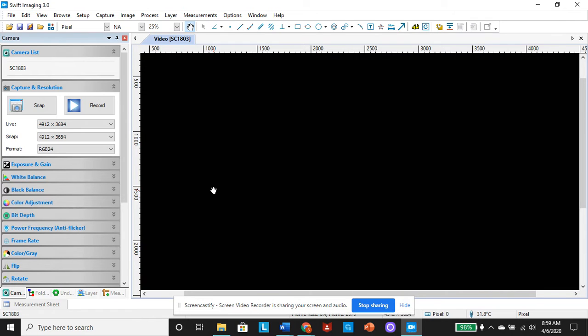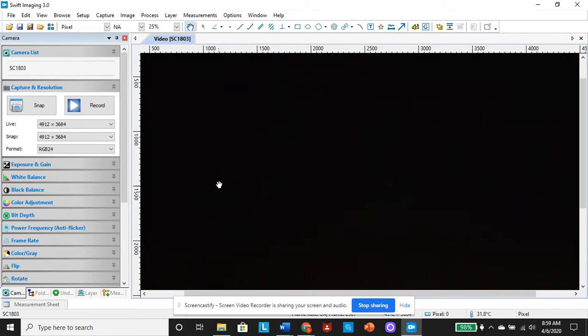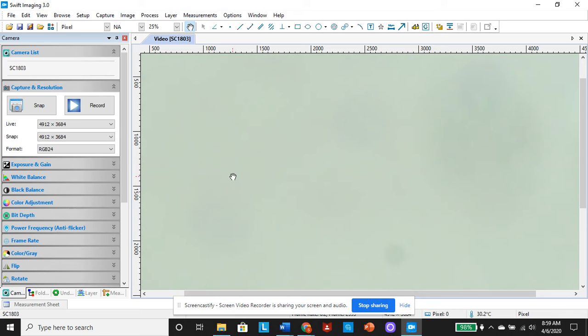We're going to 40. All right. Let's see what 40 gets us. Ooh, did you see that? It's coming back. All right, 40 times objective.